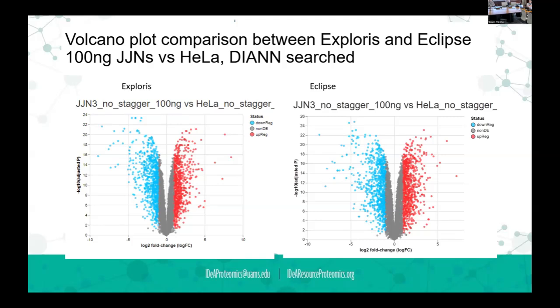Because really what we see is that for DIA, when you start getting down into the lower signals, I don't know how much to trust that, but I'm sure with that same data set you could manipulate some analysis factors and probably get closer to a 70-75% overlap just by employing some of those methods to bring that up.